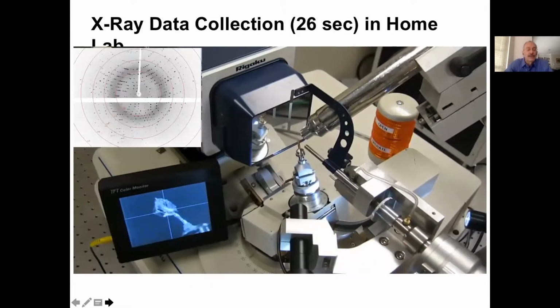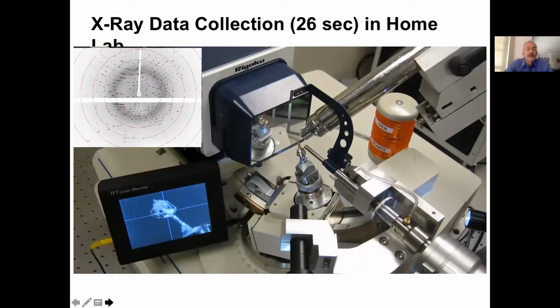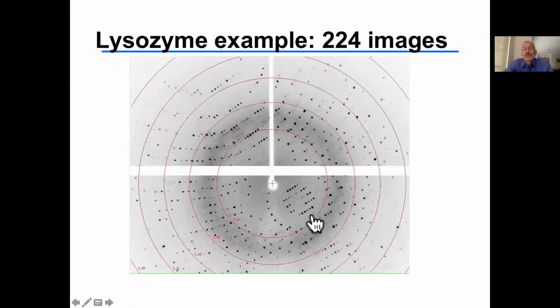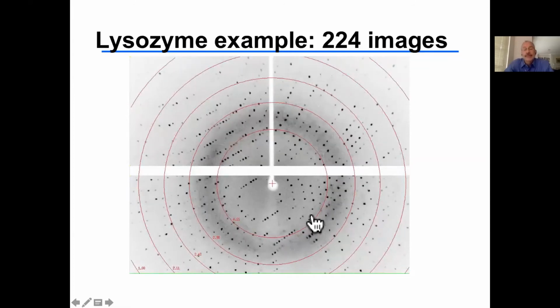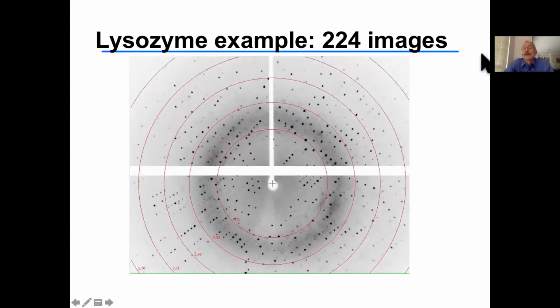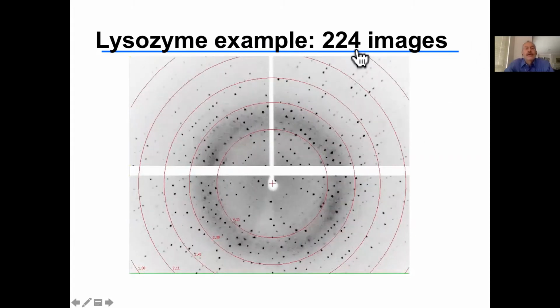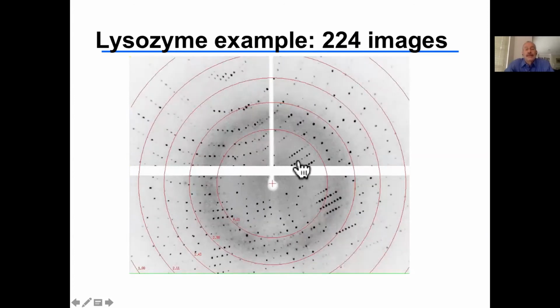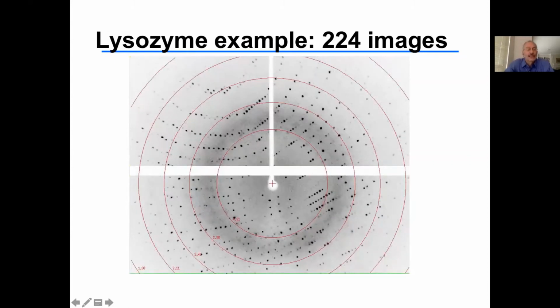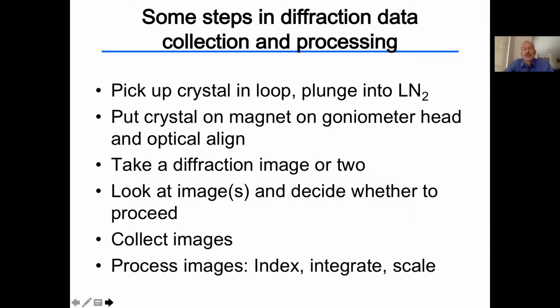Let me go on. And this shows the images themselves. It's a two-chip, two-segment detector, and this shows the images as they are collected in a higher resolution there. Okay. And as you can see, the spots change from image to image. Some are strong, some are weak, and so on. So that's the experiment that Gianluca described yesterday.